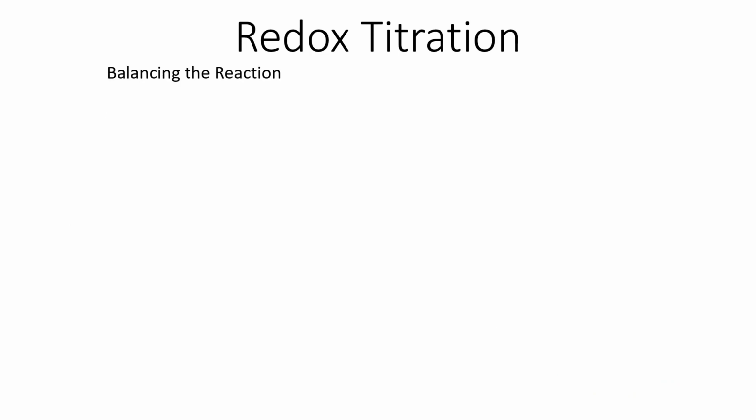All right. Let's go and review some of the things you'll have to do in advance of the lab. There's 2 things in particular. Now, the reaction is C6H8O6. That's called ascorbic acid or vitamin C. We are reacting with iodine.